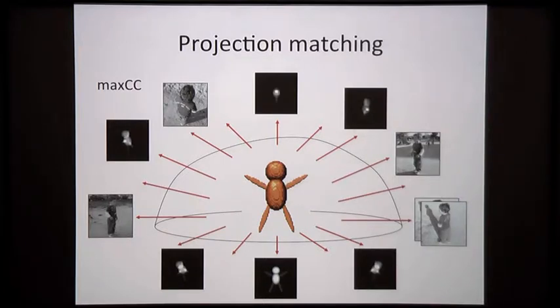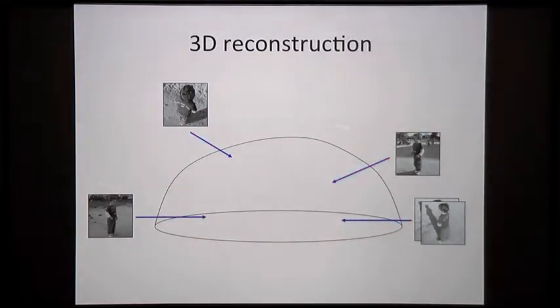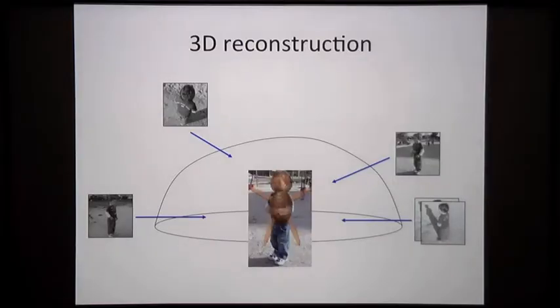And then at the end of what would be one iteration, we then have orientations for each particle, and then, for example, using the Fourier slice theorem, we can put those slices back in the right orientations in the 3D transform and do an inverse transform to get back to something which is now better. It's a better representation of what's really going on in our data than this initial crude model, which was just an orange puppet.